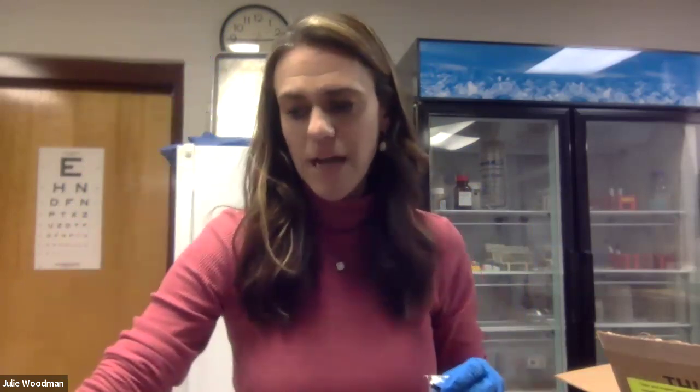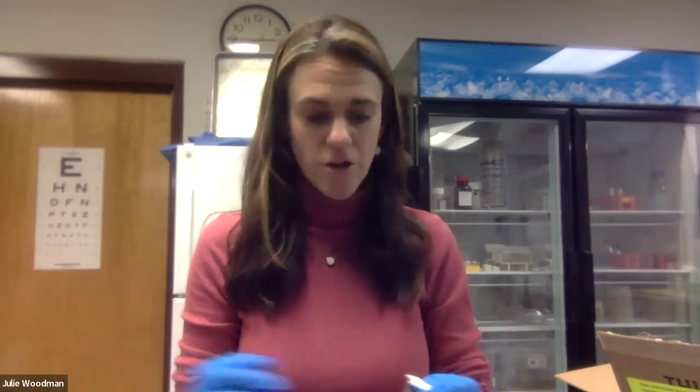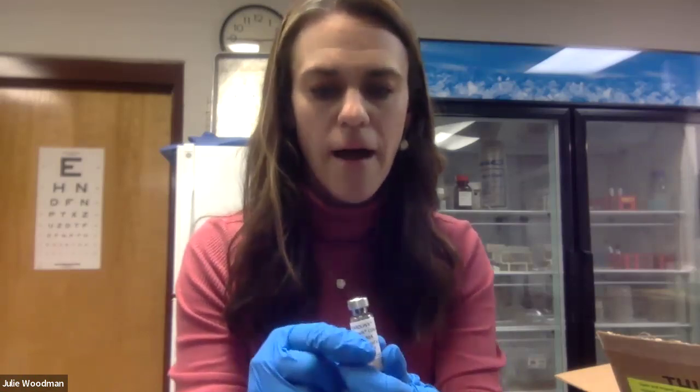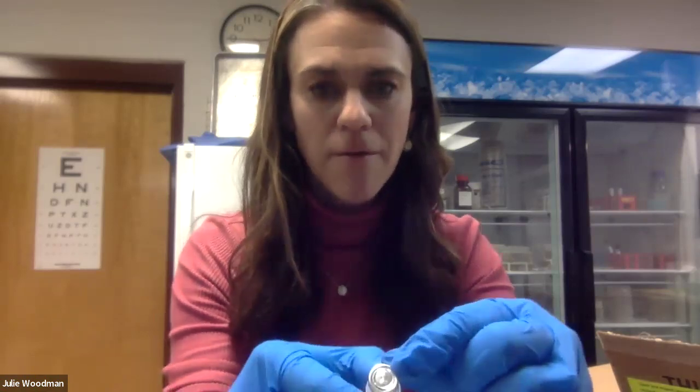We will be pipetting some of the broth into the culture tube, and then using that liquid culture to transfer everything back. The next thing to grab is a sterile transfer pipette. It's also a good idea to have a designated dirty area on your bench where you can put anything that needs to be disposed of when you're done using it.